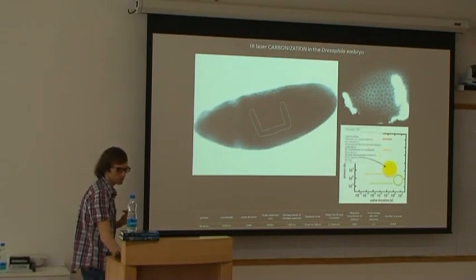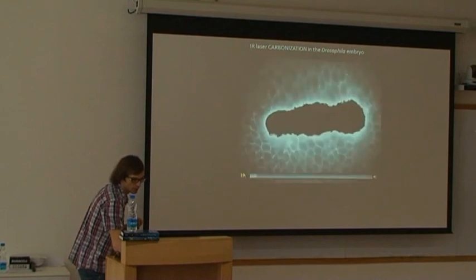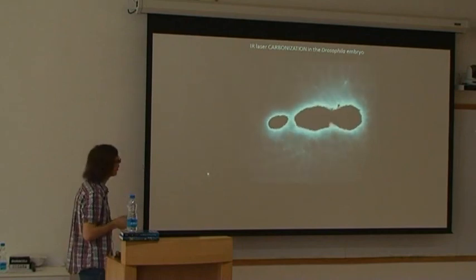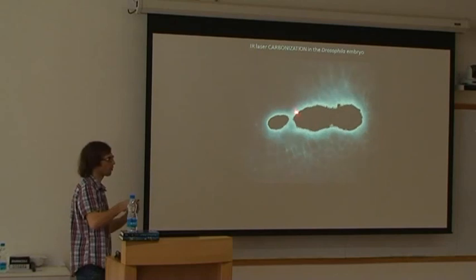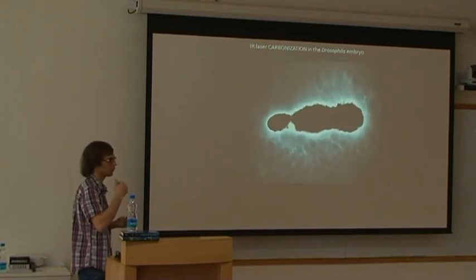So this is the thermal effect, and this is the example I'm giving you. You will see that the cells are blocked on one side, and on the other, they kind of flow around. And these cells seem to be stretched, as if it were a really fixed anchorage point.